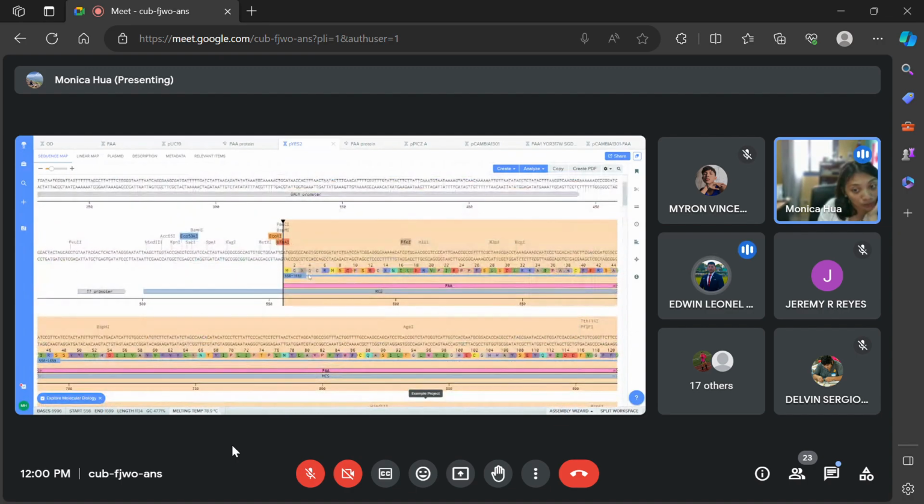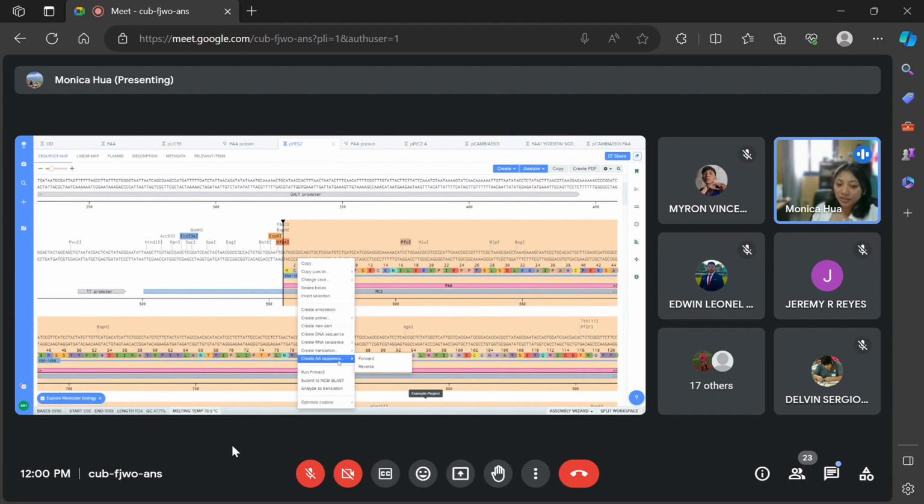Is that part of the assignment? If not, then you have to learn it. I will give you points for it. But you just need to right click, and you just need to create amino acid sequence, and that's it. So you just click okay, thanks.